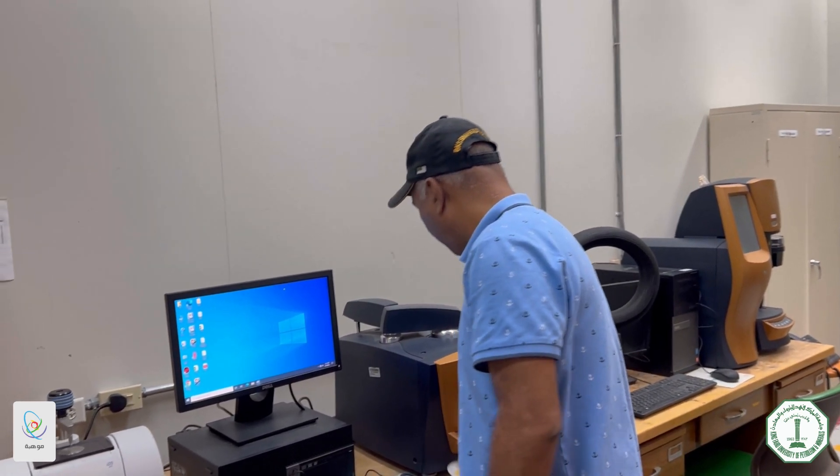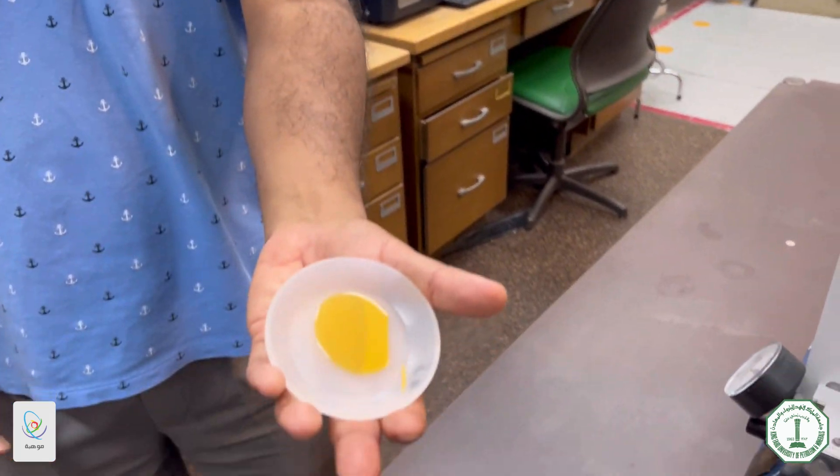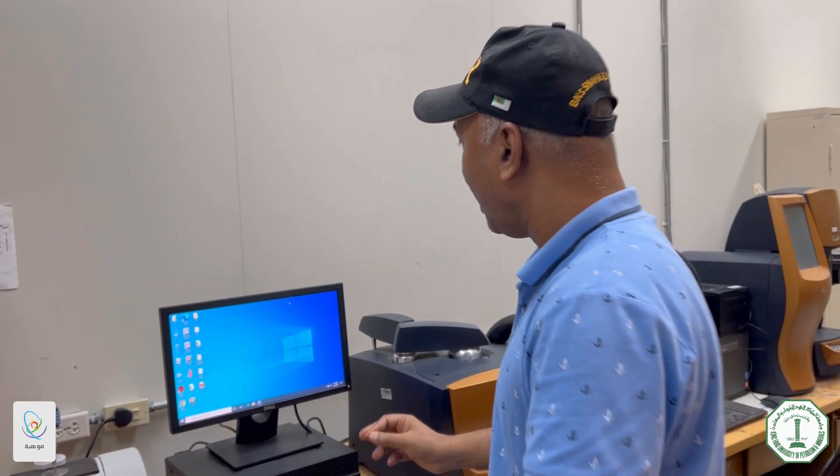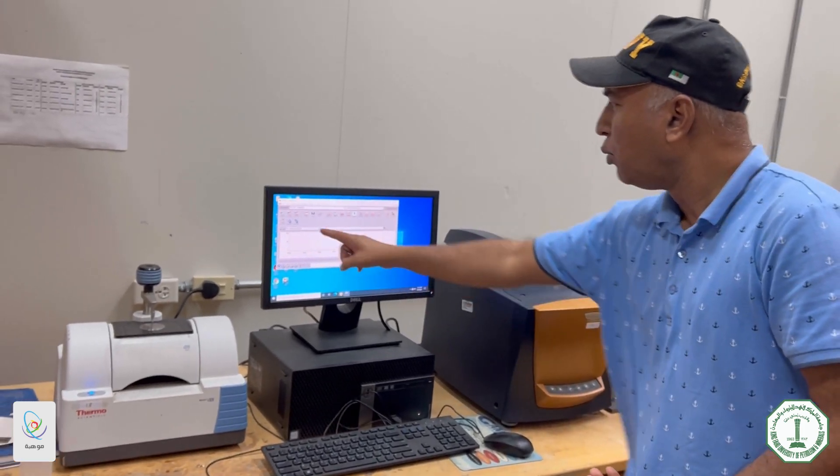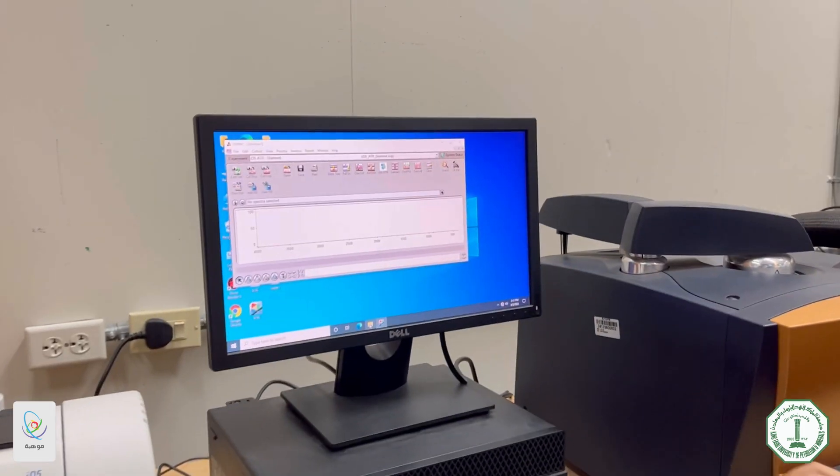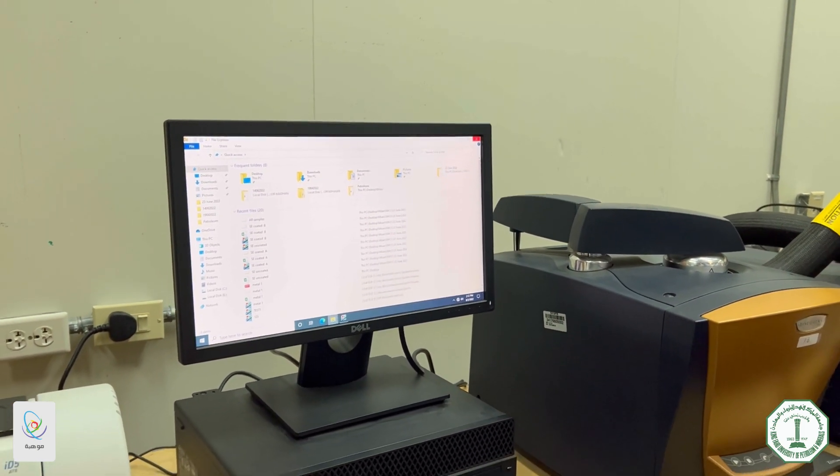For example, if you want to see the structure of a compound, there's an easy way. We are experts and hopefully some of you will join here and do better than us. One of the targets of this center is to make SAS materials for different applications. We make materials like this one — it has a very beautiful yellow color. We made it capsule form. This is FTIR — here we will get a spectrum, and from this spectrum we know that we made what we wanted.